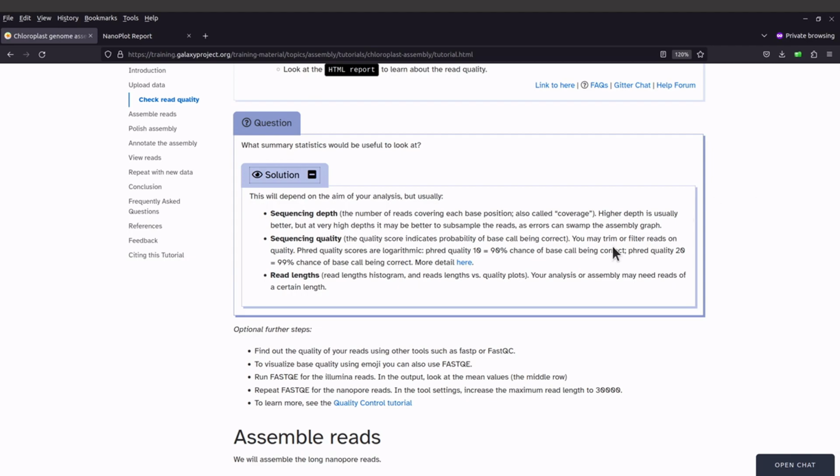There are other tools that you can also use for quality control. Some of them are used for assessing the quality. Some are also used for removal of low quality reads or reads that are short, etc. So you can check the list here and then also check online. There are tools that you can use for quality control.